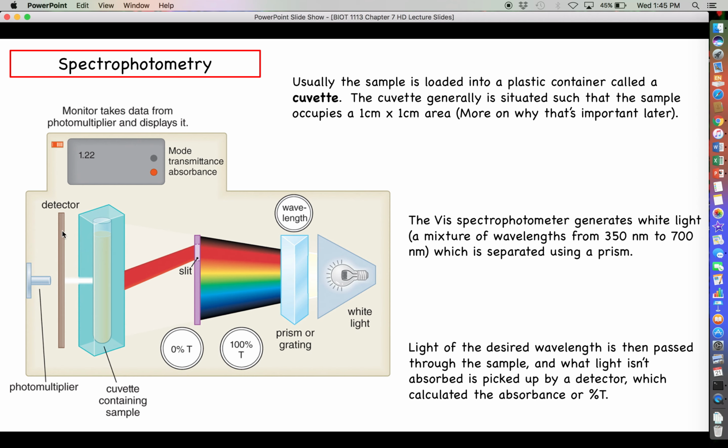As I'm sure you're already aware, the general idea we want to work with here is that an increase in absorbance of a particular sample should indicate that the concentration has gone up in comparison. This is why, when we did the Bradford assay, getting higher absorbance values indicated that we had more protein in the solution, both in the standards that we used to make our standard curve and also in the unknown bacterial lysates.